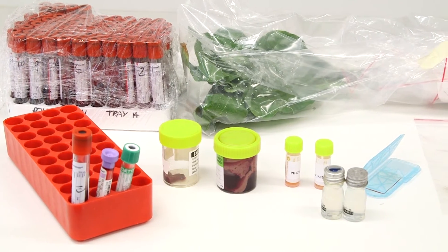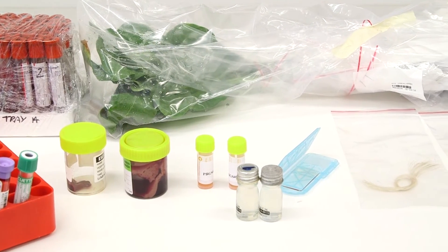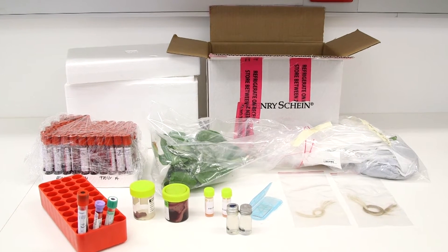By following these simple steps we can perform your tests quickly and accurately. Firstly, all biological samples including blood, swabs, liquids, bodily fluids, tissues, hair and plant matter must be packaged in a triple packaging system.